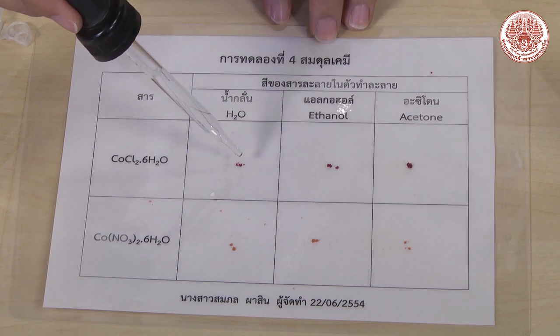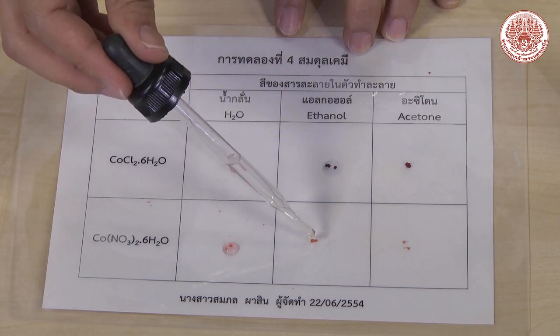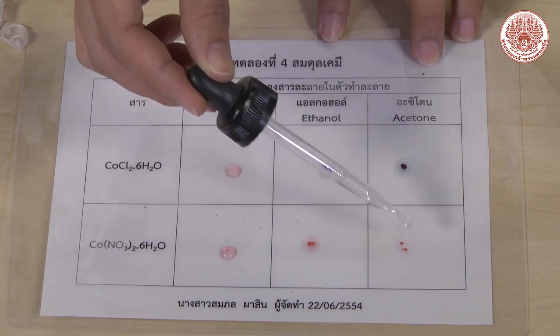In the first column, add water one drop each. The second column, add ethanol, and acetone is on the third column. Record the color of the solution.